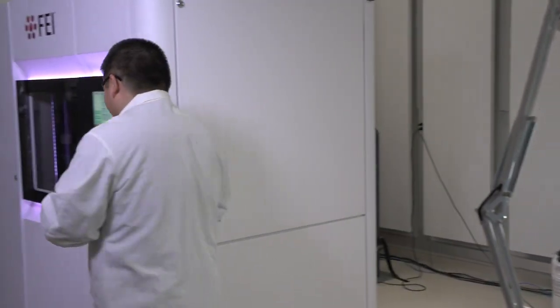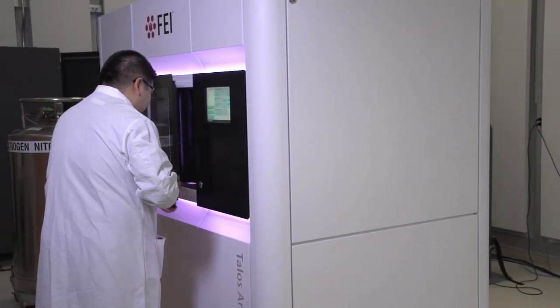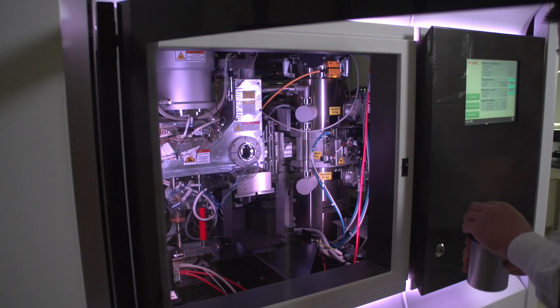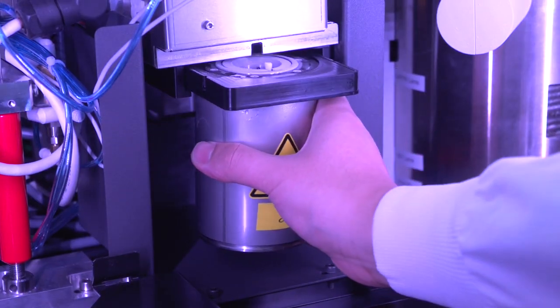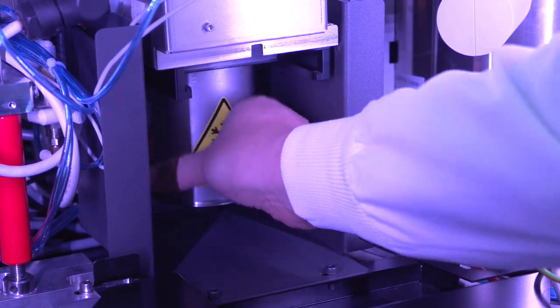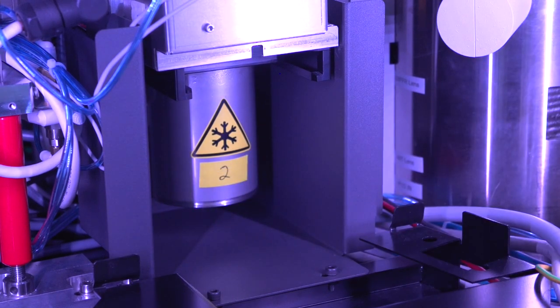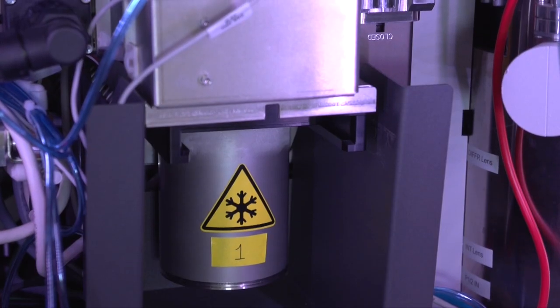The autoloader and the microscope stage are robotically controlled by the microscope. Once the appropriate sample is identified, the microscope can automatically collect thousands of images over the course of several hours to days.